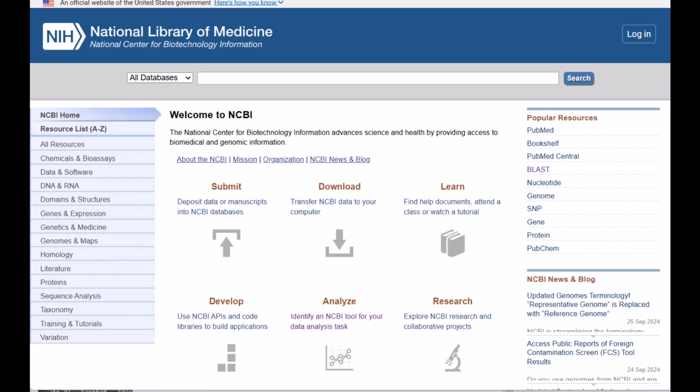All right, so now up to another adventure. I want to compare two sequences that are similar, and I want to see how similar they are or where their alignment is. So from one of the last exercises, we had a DNA sequence that was isolated from a bacterium that lives in the gut of an insect, and we had a short sequence there. It was only a partial sequence, and we didn't know whether it was messenger RNA or ribosomal RNA.